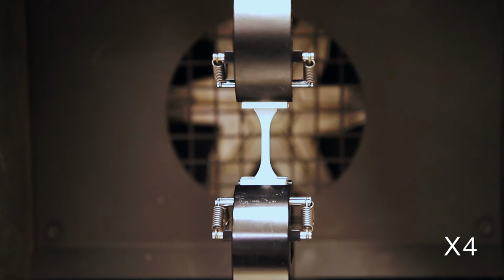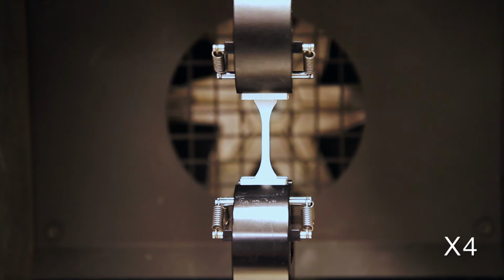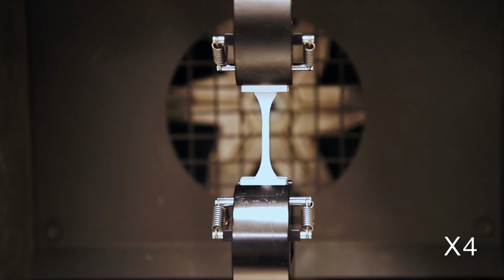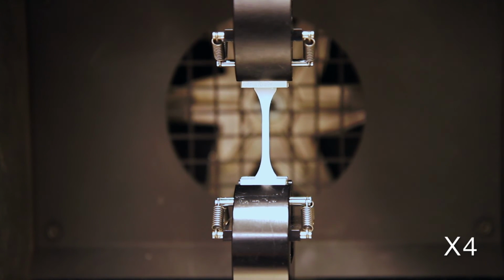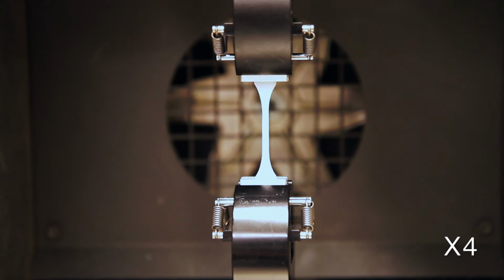The sample that appears in this video is ASTM D638 Type V. It has a specific shape and dimension used for tensile tests. The sample in the video is stretching at 0.1 mm per second. The force and position obtained from this testing are plotted onto a stress and strain curve. We will obtain more data and further analyze the property of the SMP and SMP composites in the coming fall.